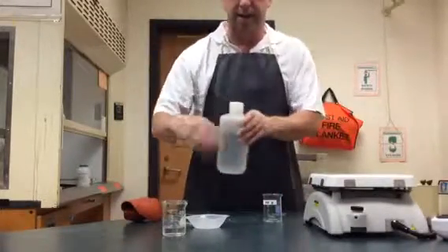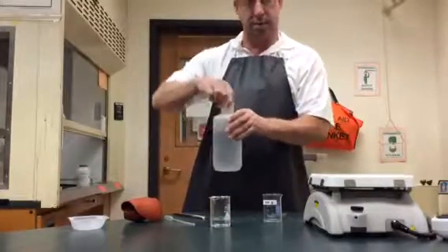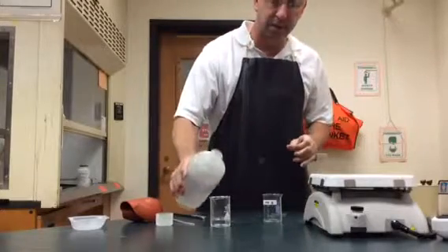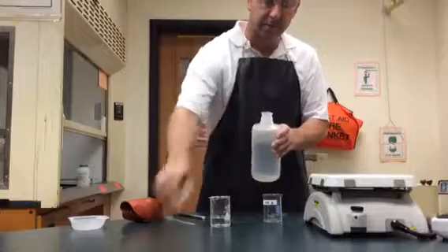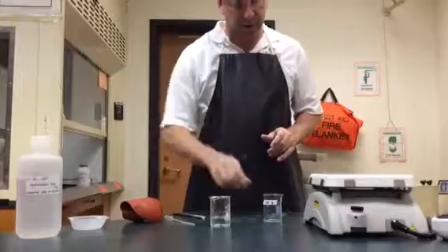I've taken some hydrochloric acid and poured it out into a beaker. The lab might call for 10 or 20 milliliters, meaning I don't need to measure it very accurately. I immediately put the cap back on the hydrochloric acid and move it out of the way.